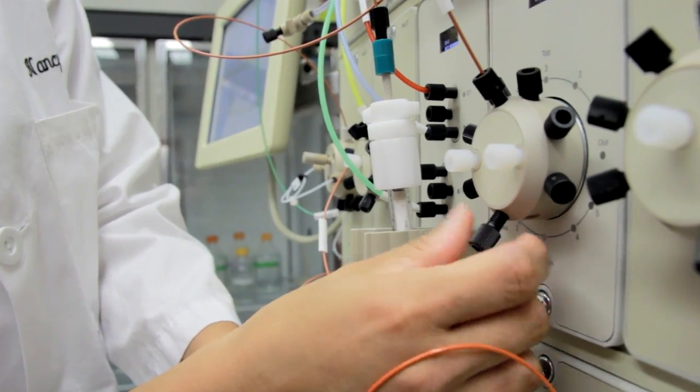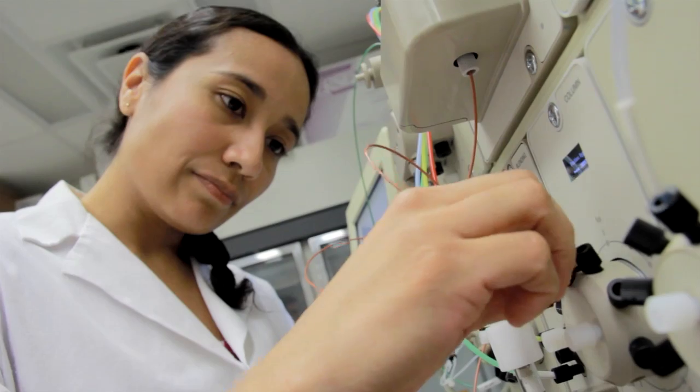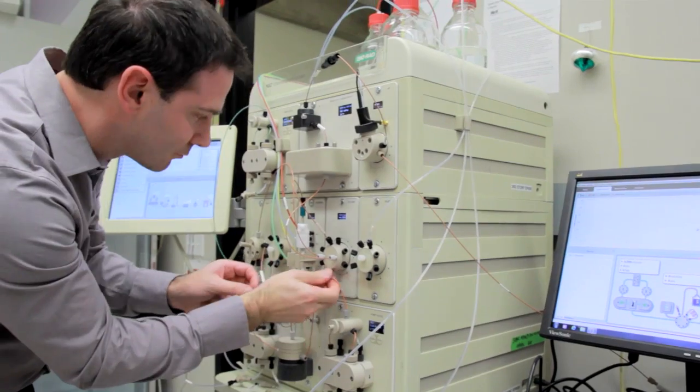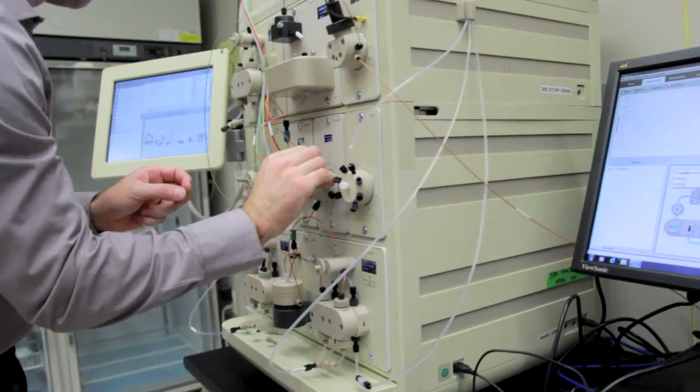So the NGC system is really good for our research for a number of reasons. One is the modules allow you to customize the system over time, which is a good feature. The front-facing system actually is very good because it allows you easy access to all of the different valves and connecting columns to the system.